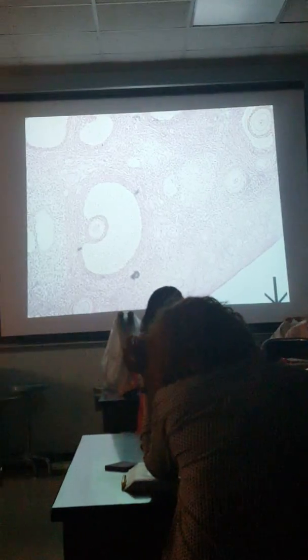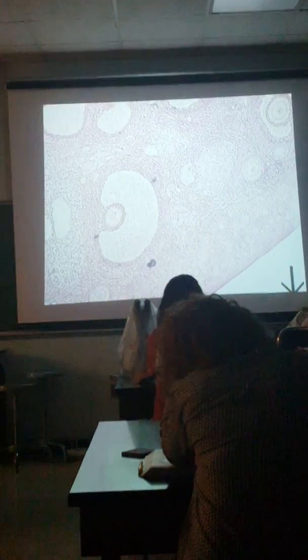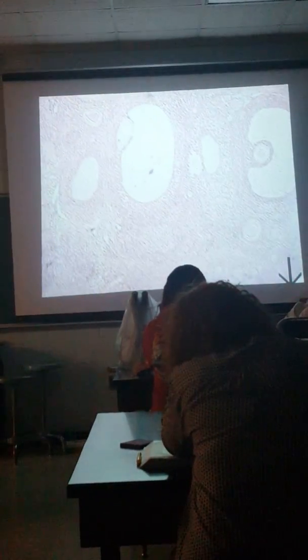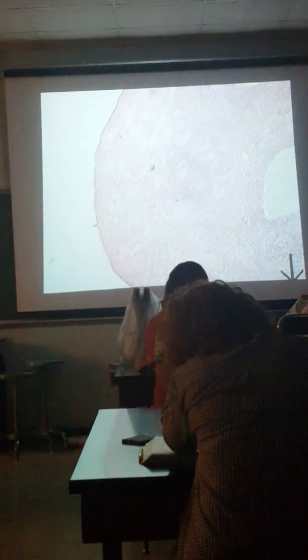Here we see antrum formation. This is a secondary follicle because we see antrum. But a bunch of primordials.